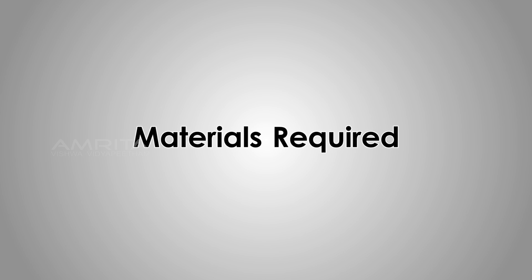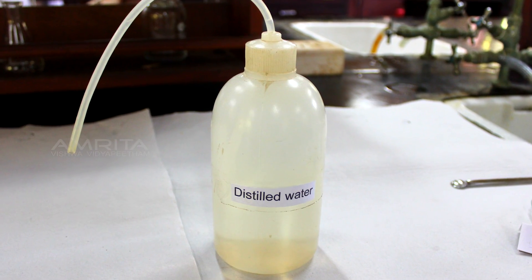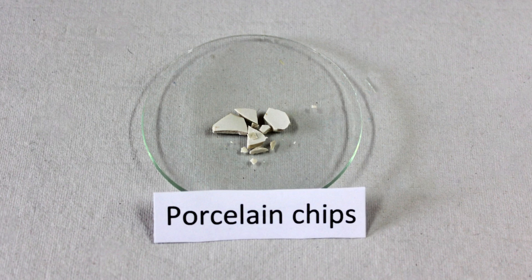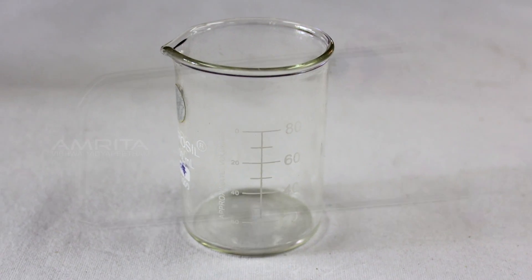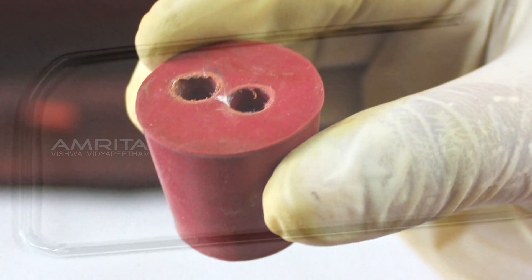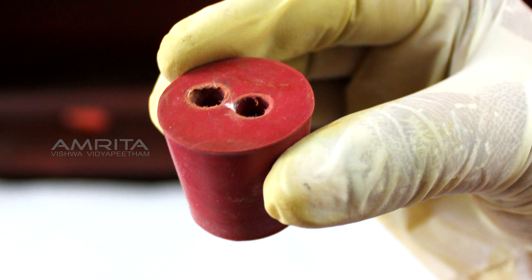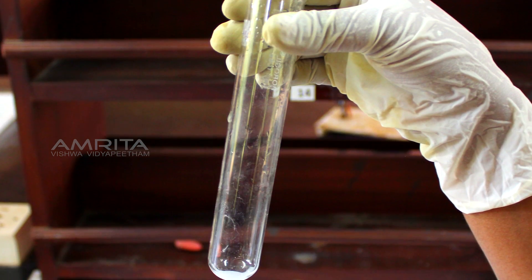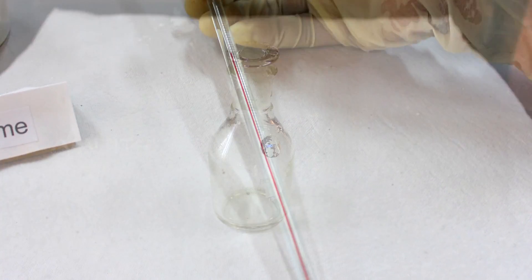Materials required: Distilled water, porcelain chips, beaker, delivery tube, rubber cork with two bores, boiling tube, thermometer and a bottle.